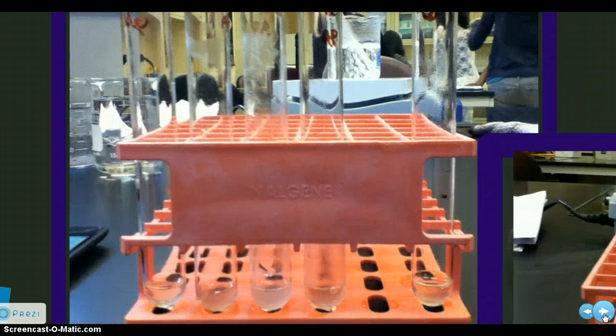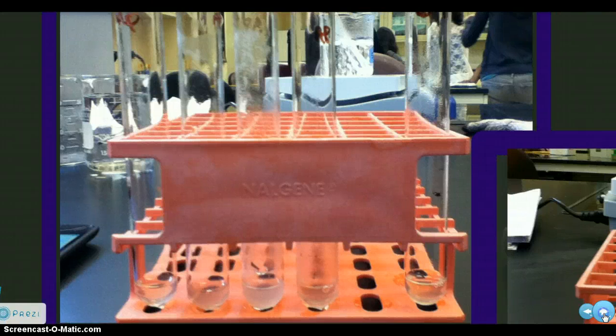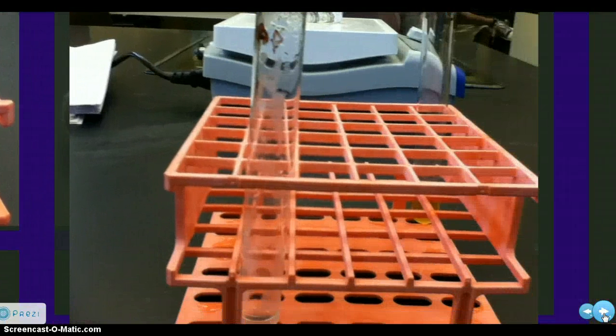So this is our control, the before picture, what we had before we knew what the change would be. This is right after their water baths. You might be wondering why there's a gap. It's because test tube 5 is off in the corner right now because it took a while to warm up. So that's test tube 5. And what we did is we added catechol to each one.